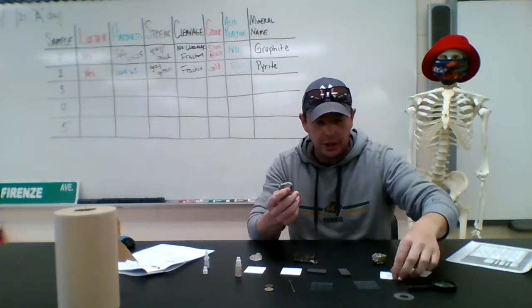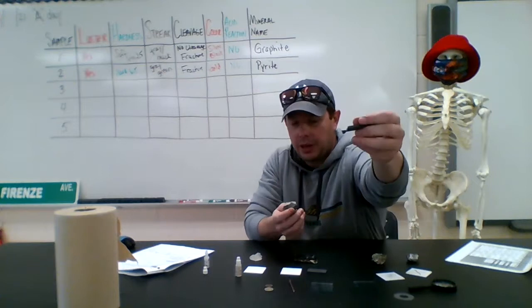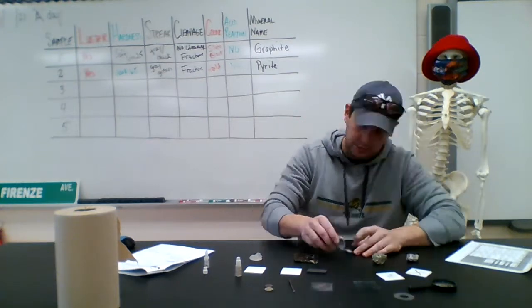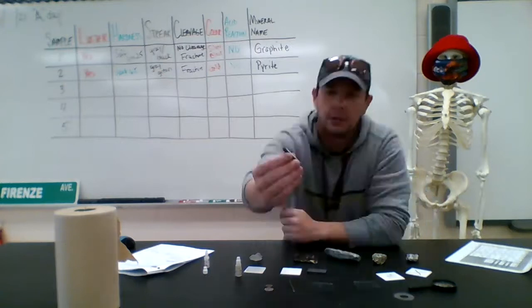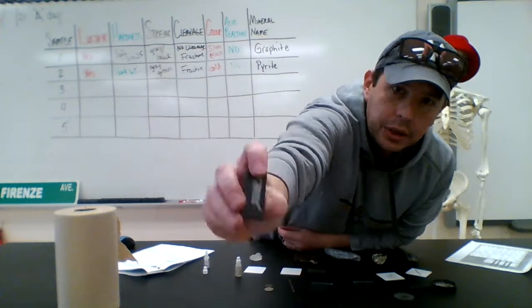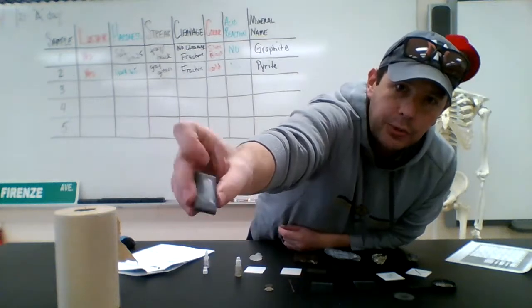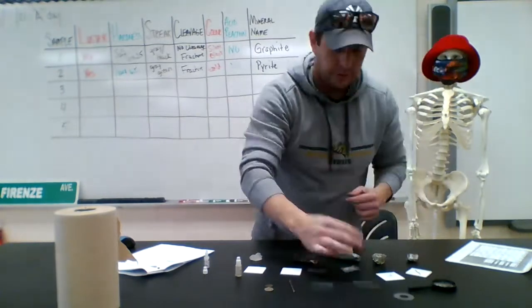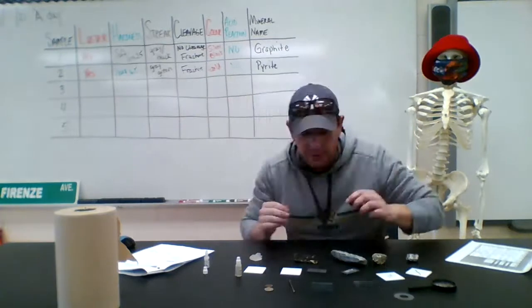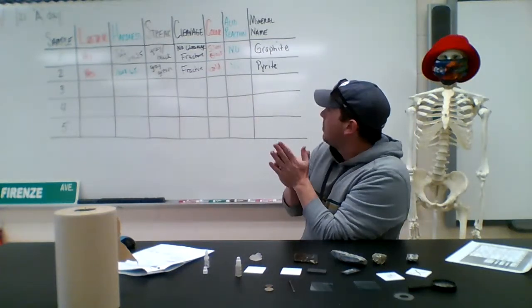Okay. What is the streak color? I keep using all these plates. I'm going to use a black streak plate instead this time. Let's see what it looks like. What do you see there? Yeah, it's like a white powder. It's a white powder. Keep that in mind. I'm foreshadowing. It's a white powder. And it smells nice. It smells like something familiar. All right, so it streaks white.